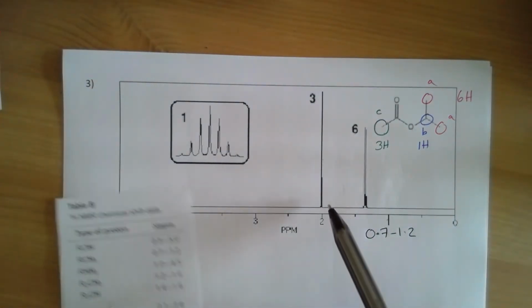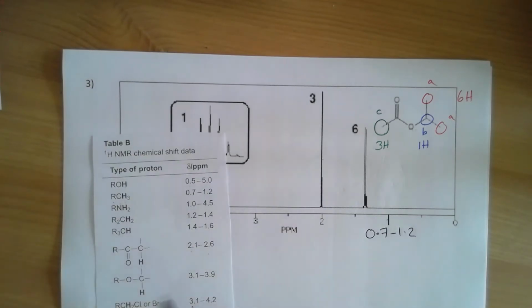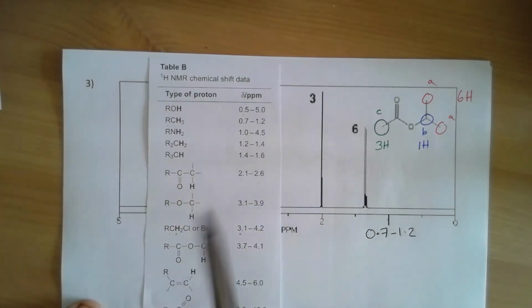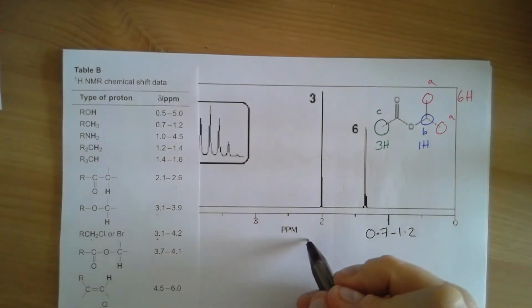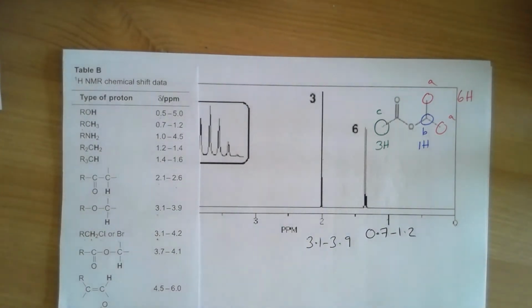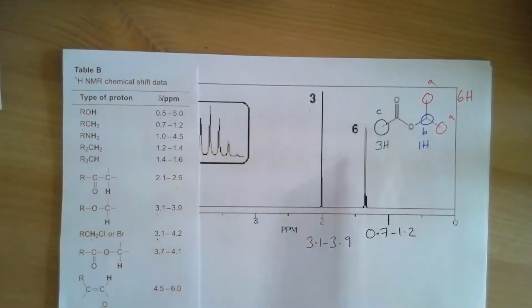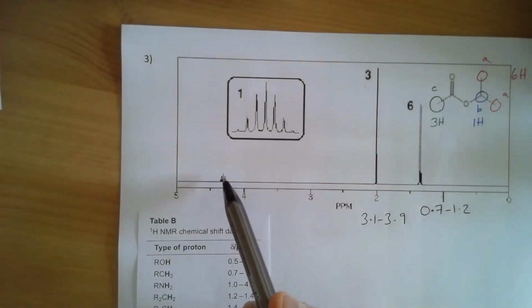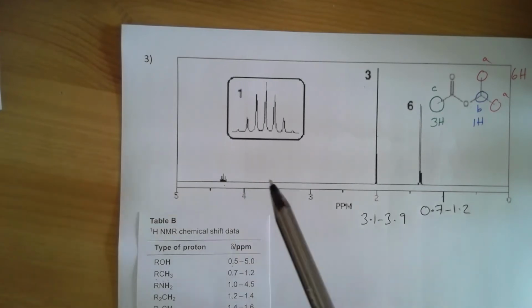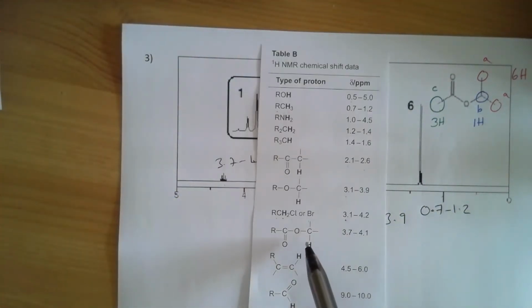Our environment C here is again likely to be one as a result, next to an oxygen, carbon next to an oxygen there, so 3.1 to 3.9 is a little bit out of the range, but it's not a bad fit, and we can definitely identify it as a result of the hydrogen, and as a result of the carbonyl group there. And our final environment, the environment B over here, that is definitely within the range of 3.7 to 4.1, which is as we expect on here.